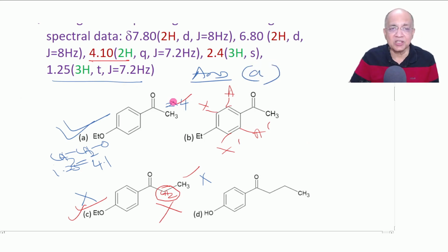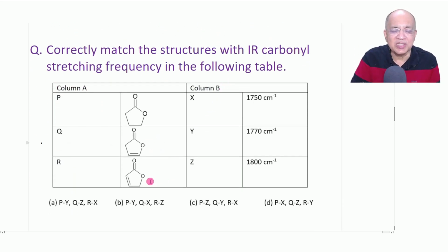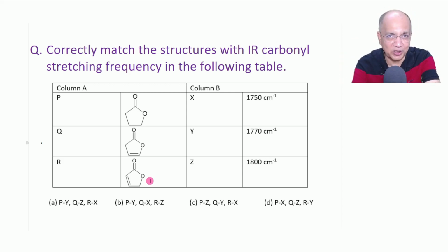Now coming to the next one. I have just introduced, for the first time, a problem on IR spectroscopy.